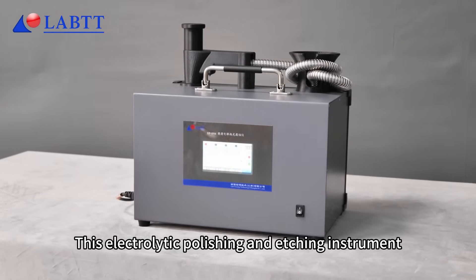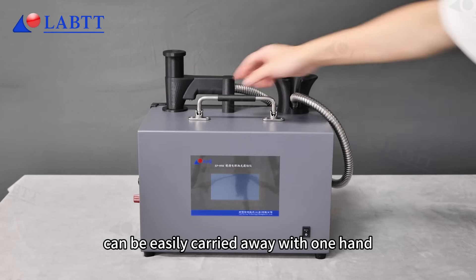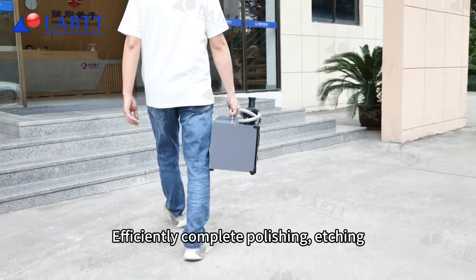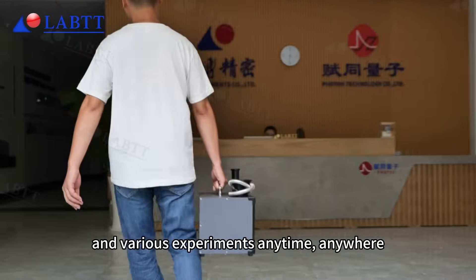This electrolytic polishing and etching instrument can be easily carried away with one hand. Efficiently complete polishing, etching, and various experiments anytime, anywhere.